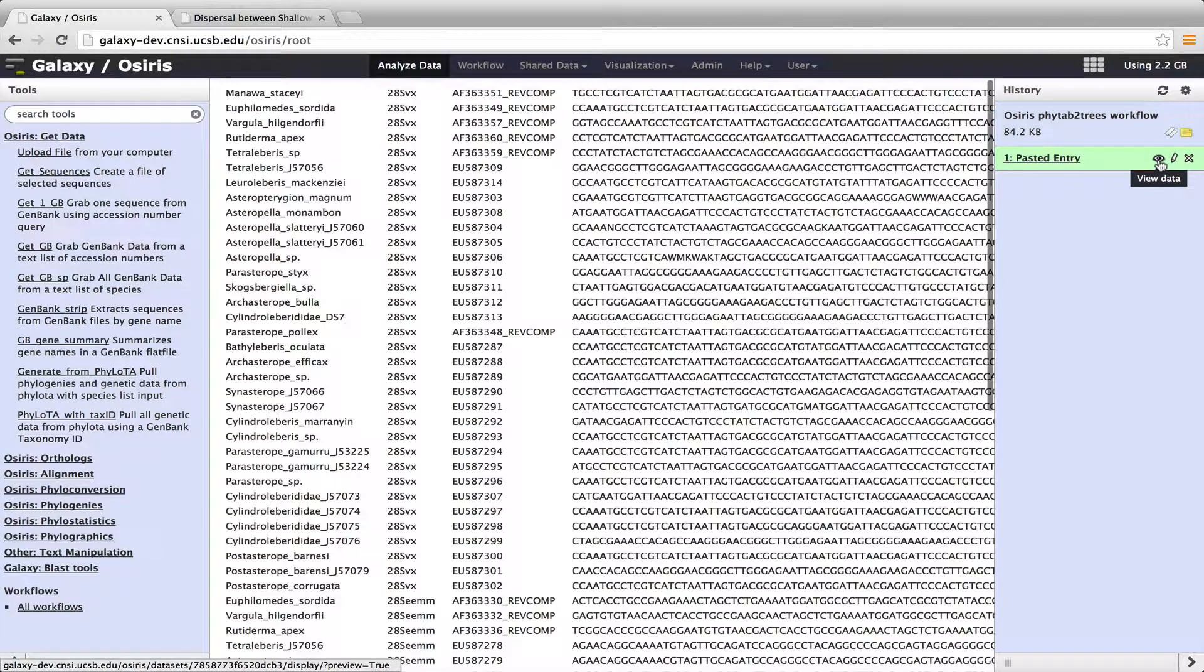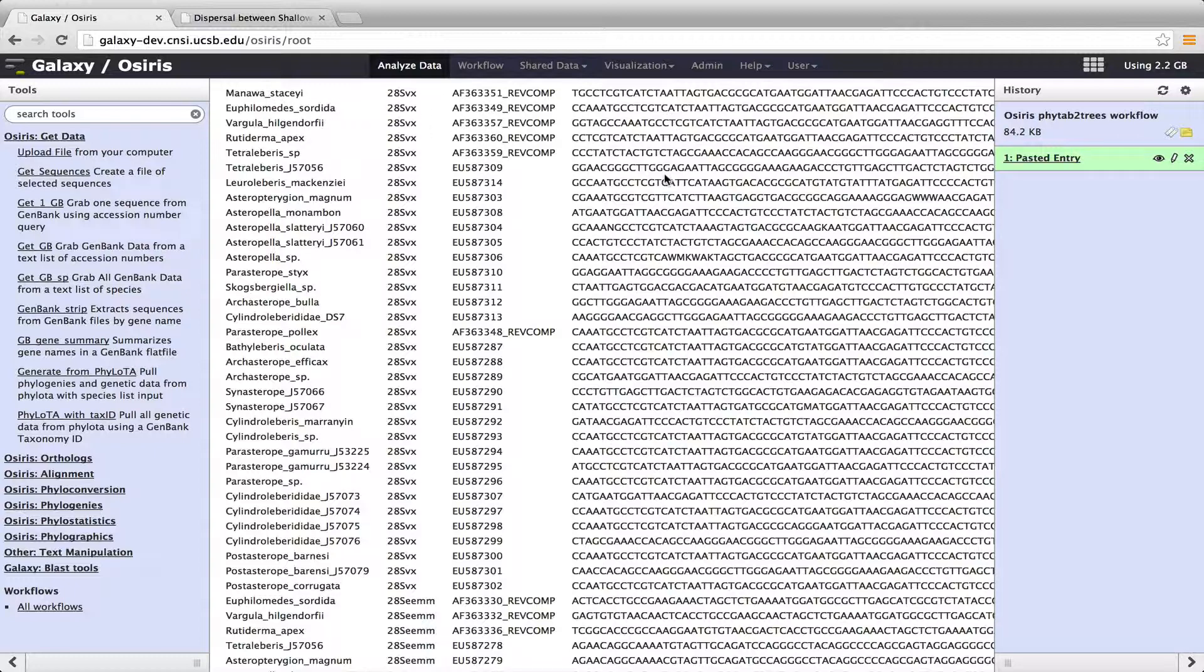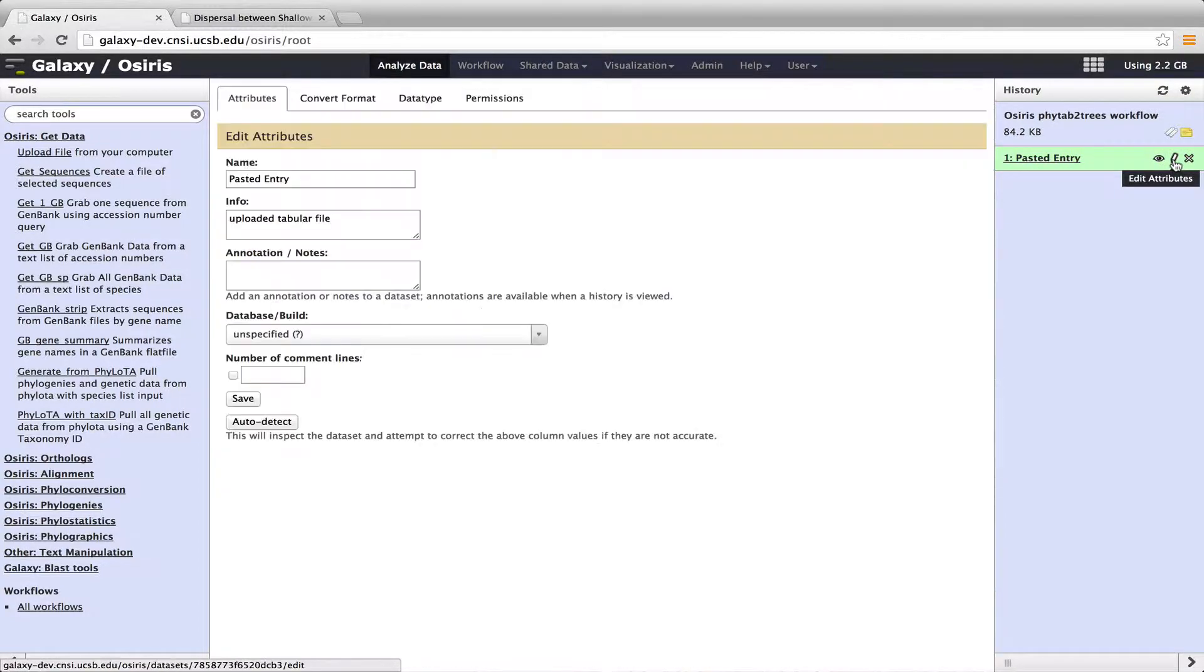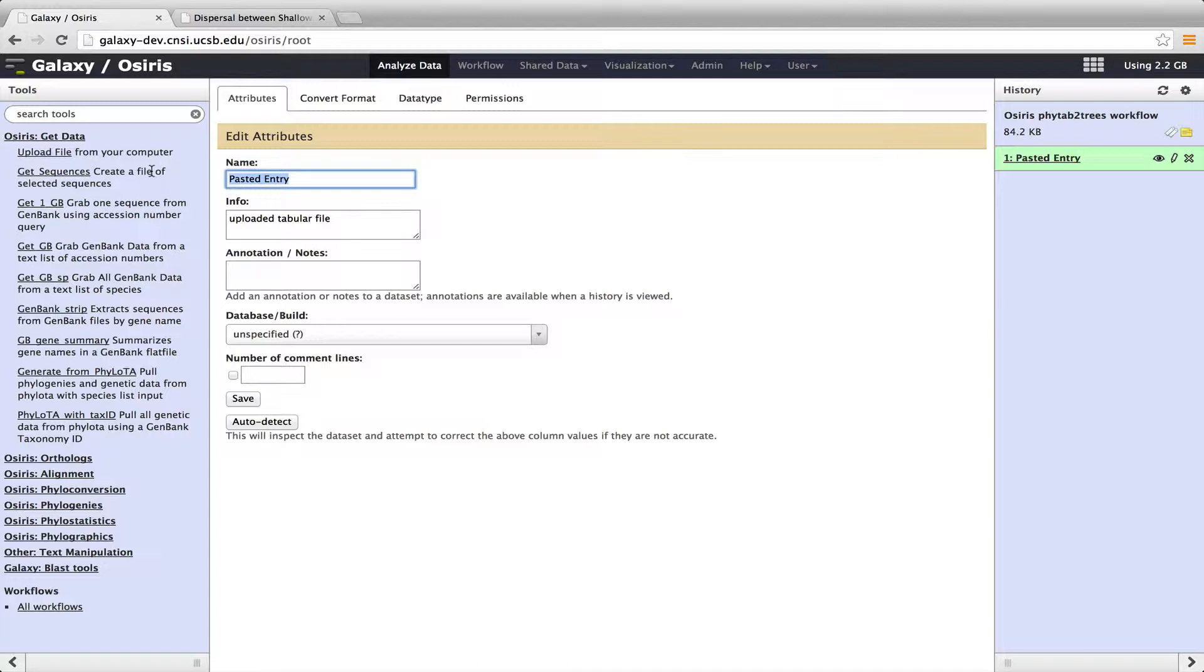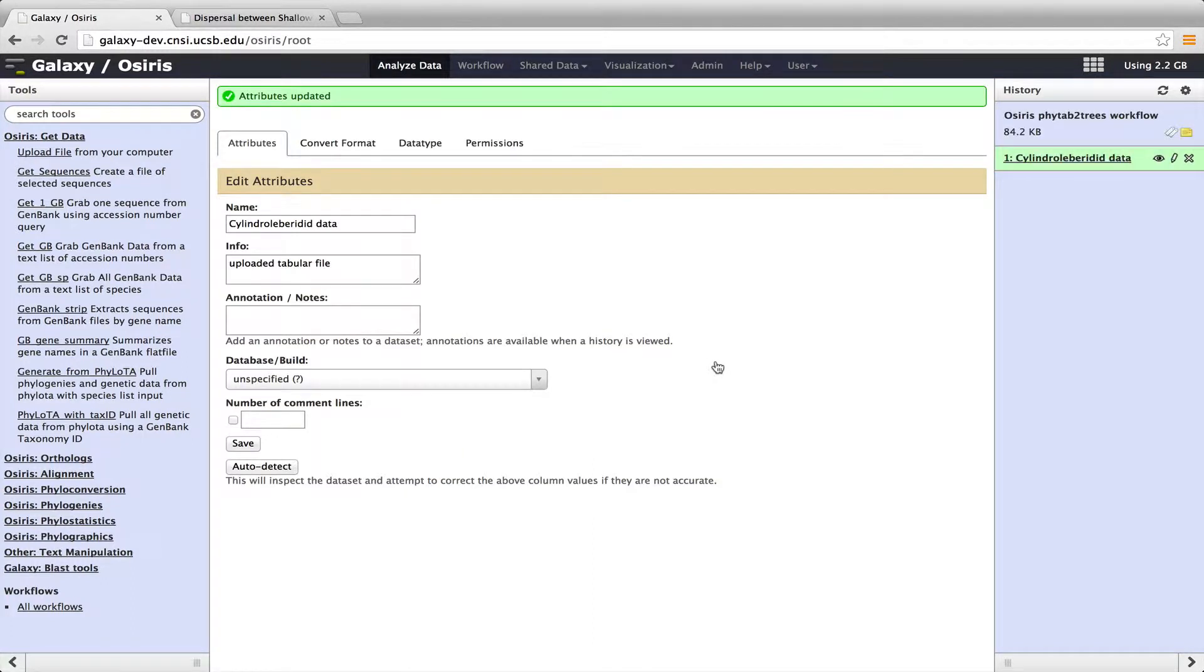So now we can have a look here using this eye, and you can see the same data set here with this PHYTAB format, what we call PHYTAB format, first column species, second column gene name, third column accession number, fourth column sequence. If I want to, I can rename this by clicking on the pencil here, Edit Attributes, and I will call this Cylindraleberidid Data. Then click Save, and now that name appears in the history.